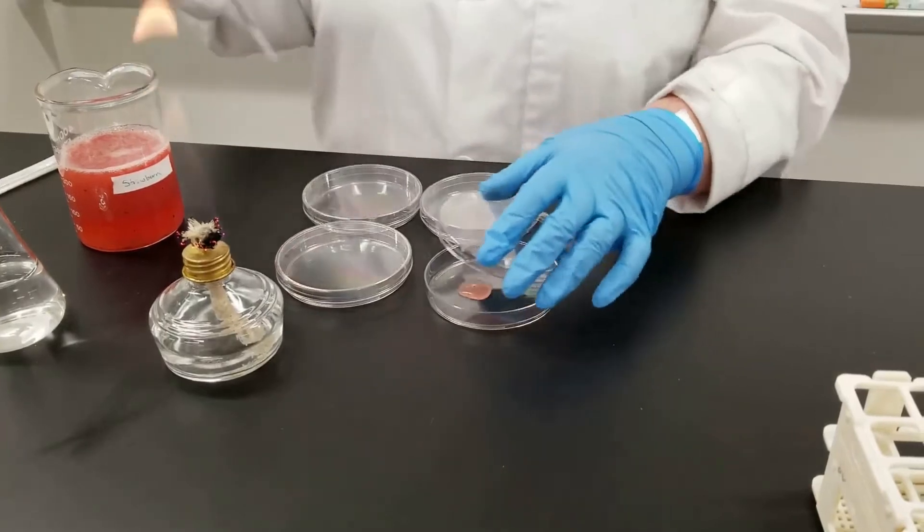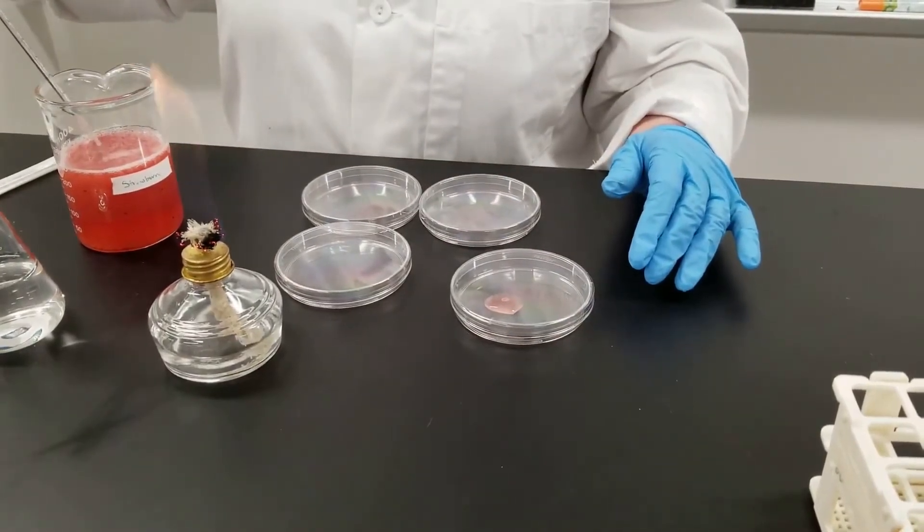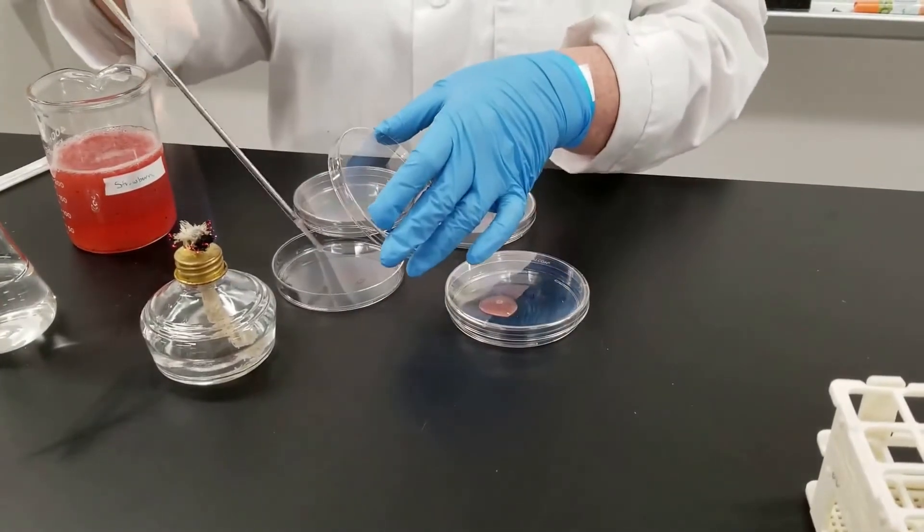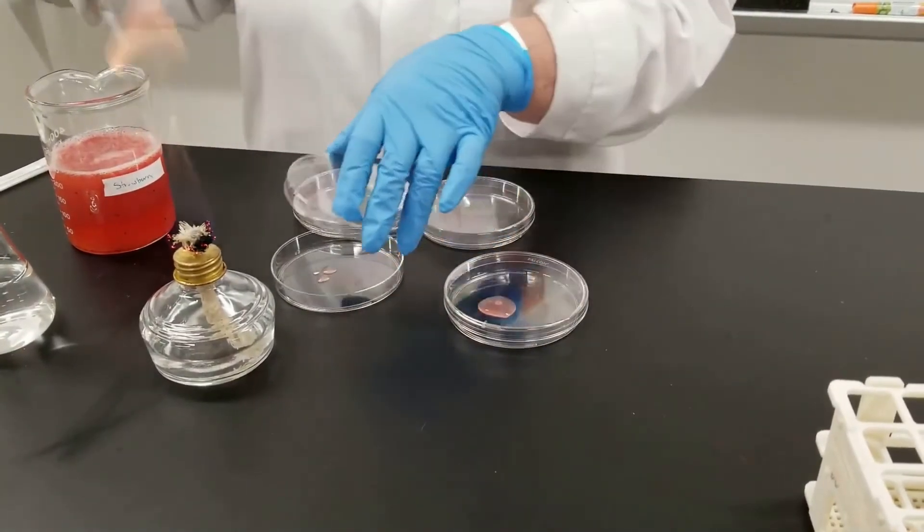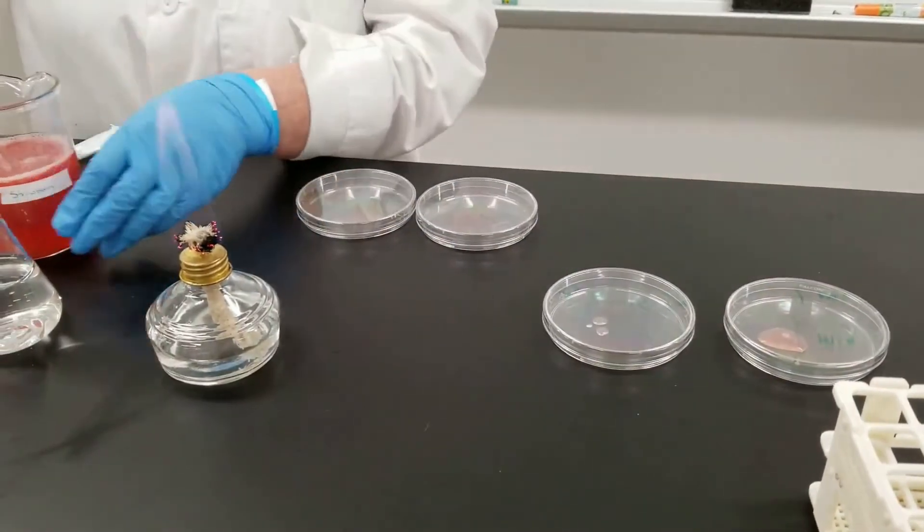And we are going to take a milliliter out of the slushy sample and add a milliliter in here. This is ultimately going to be a 1 to 10 dilution. Then we are going to take a tenth of a milliliter and put it into plate number two. That becomes a 1 to 100 dilution.